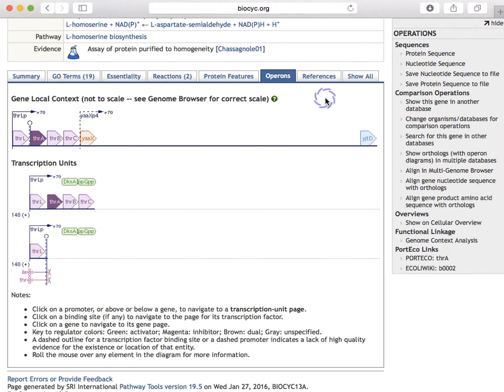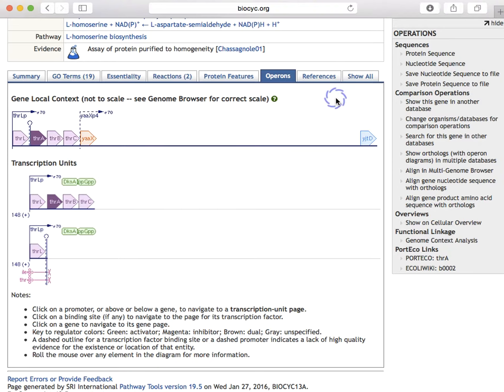The references pane shows all references for this gene, and the show all pane combines all the information from all the panes together to facilitate searching via your web browser.